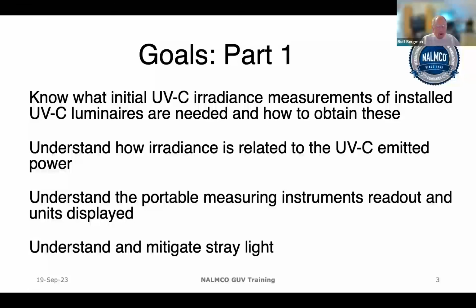For the measurements, you're going to be using portable measuring instruments that have a detector and a separate readout unit. So you will understand how to use these instruments, how to understand what the units displayed mean, and record those.